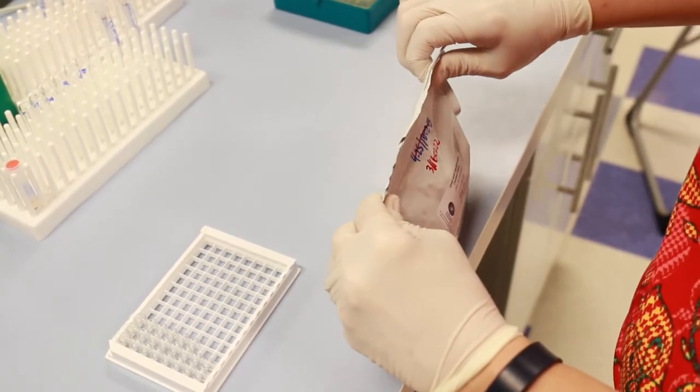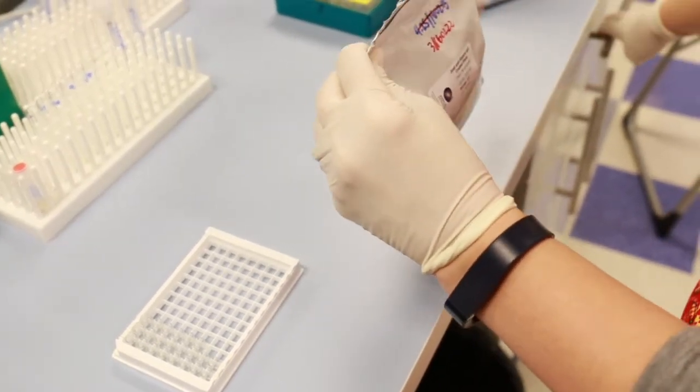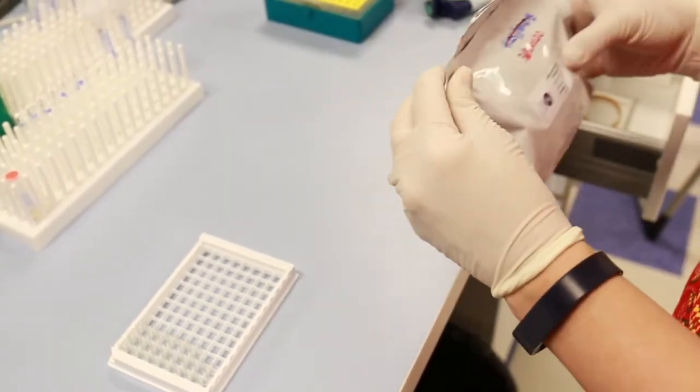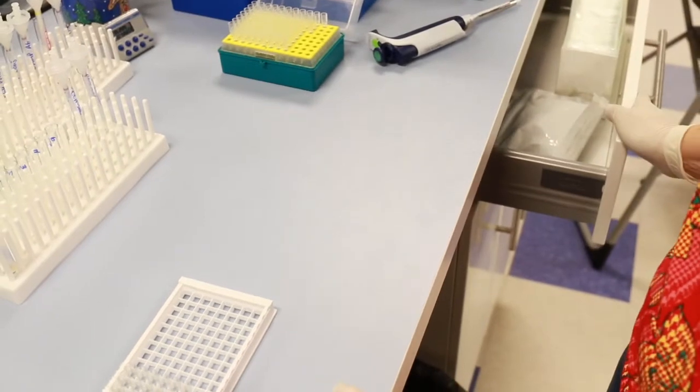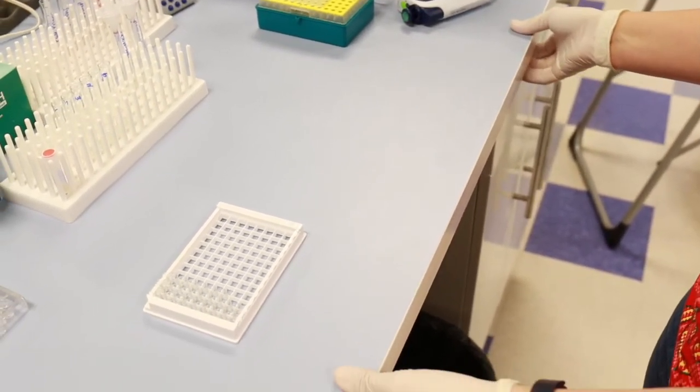You can then add the extra blue desiccant packs to opened, partially used plates for future assays to help ensure that the plates stay completely dry.